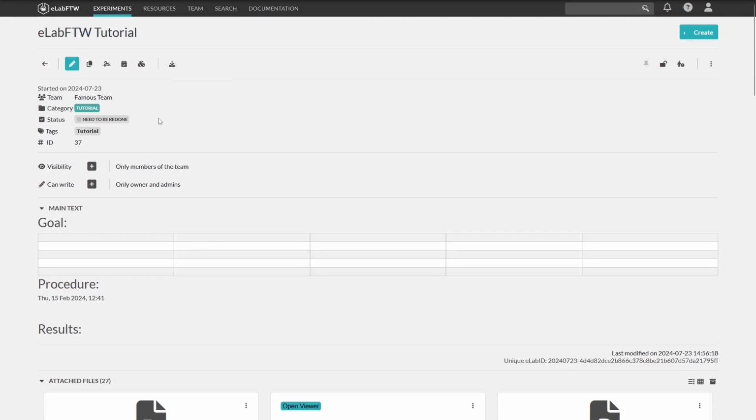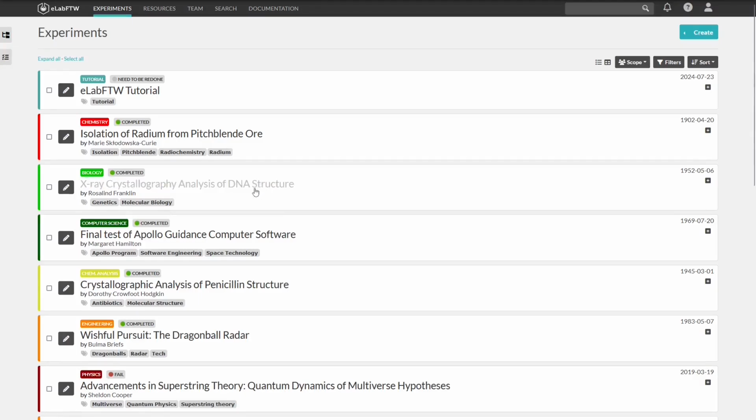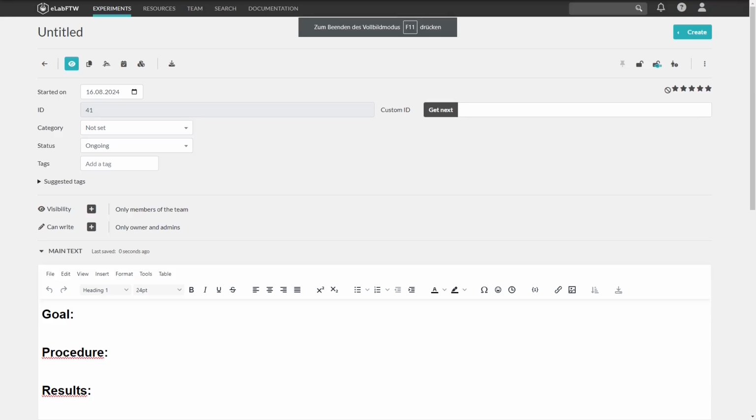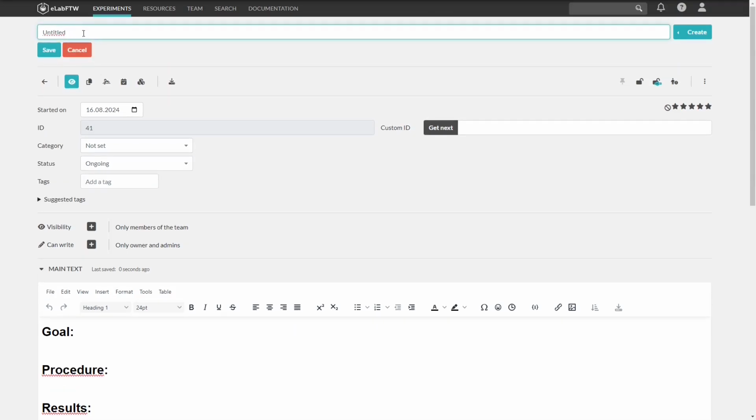Next, let's take a look at the new features for experiments. Therefore, we just create a new entry. The first thing you notice is that the title has now moved upwards. Let's just rename it to Release Video.